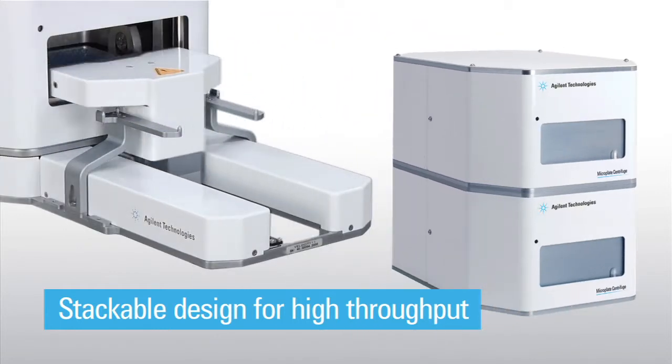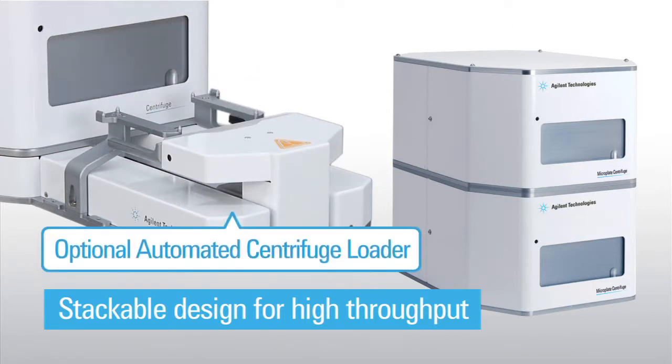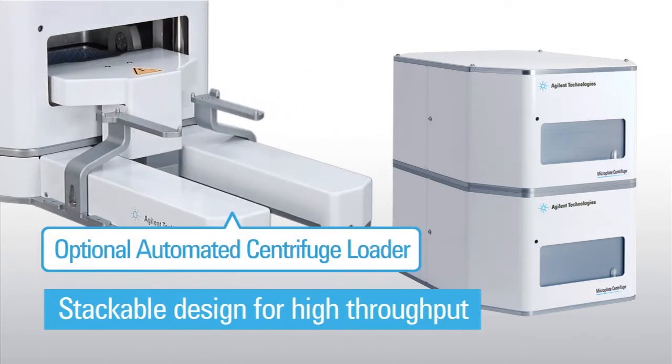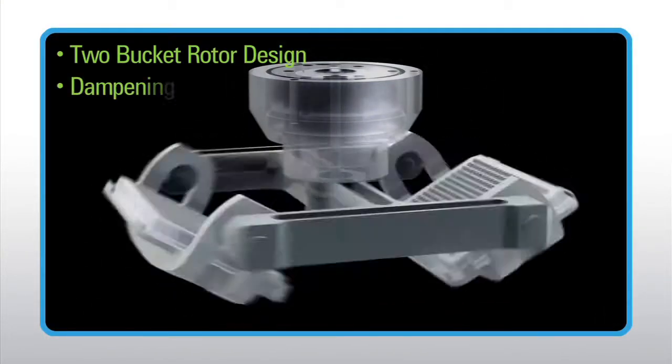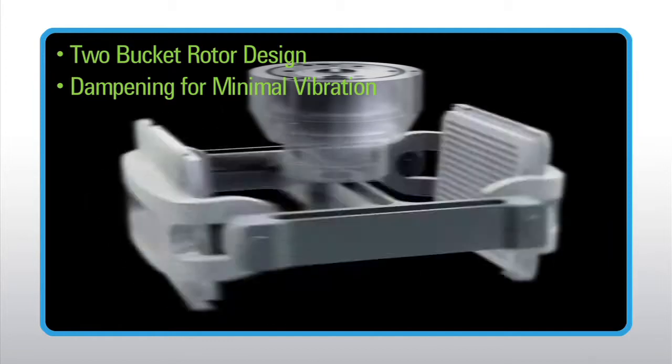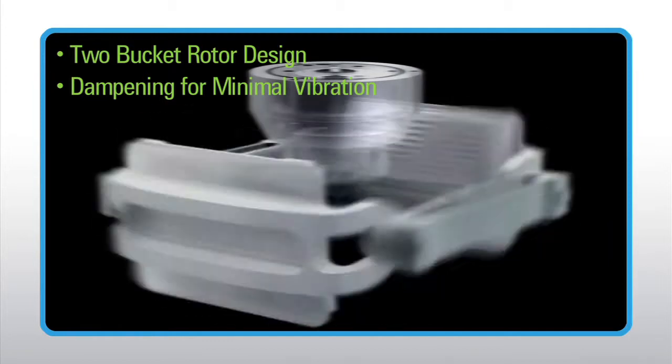For robots that cannot reach through the door, the optional automated centrifuge loader allows unobstructed accessibility. The Microplate Centrifuge features a two-bucket rotor design. Dampening isolates vibration from the mounting surface, minimizing its impact on adjacent instruments.